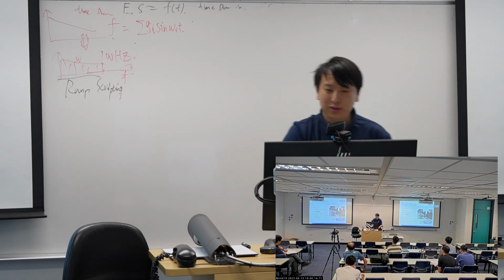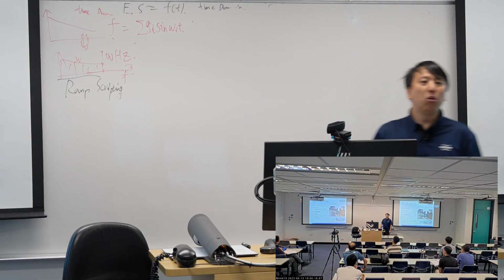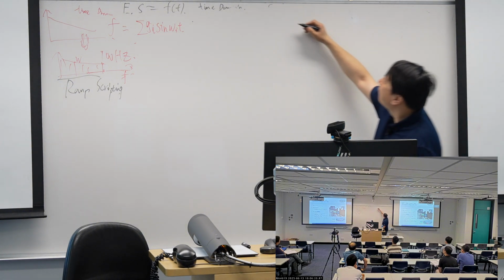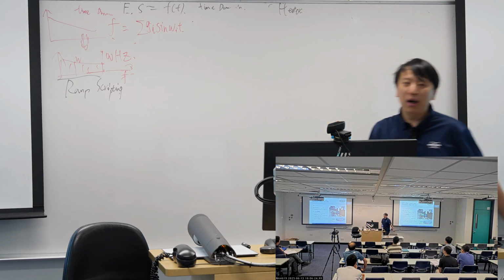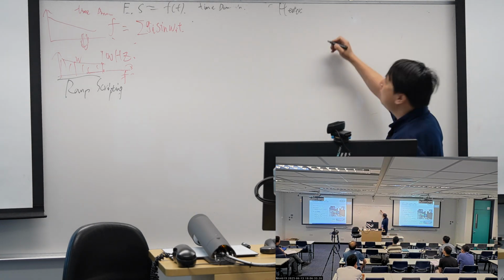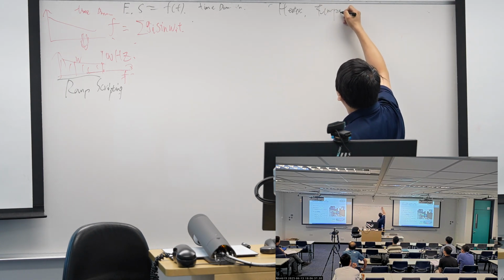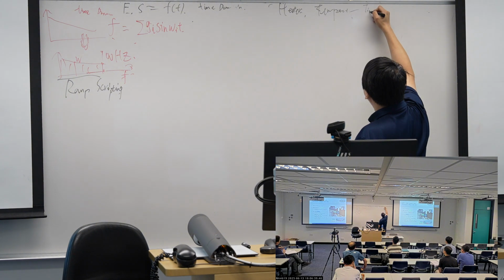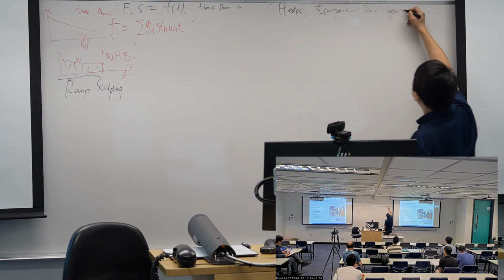So usually DMA always includes a heater. The reason the heater is widely used in DMA is due to a principle called temperature time superpositioning.